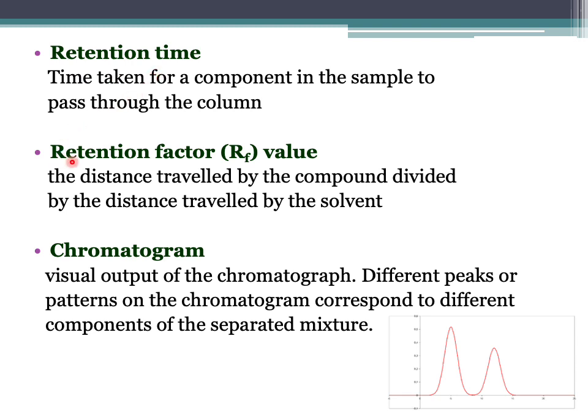So, next is retention factor, RF value. Is the distance travel by the component divided by the distance travel by the solvent. So ingat mixture tu akan melalui column. So dia punya jarak dia lalu tu itu adalah retention factor, iaitu distance travel by the compound divide with the distance travel by the solvent, the eluent.